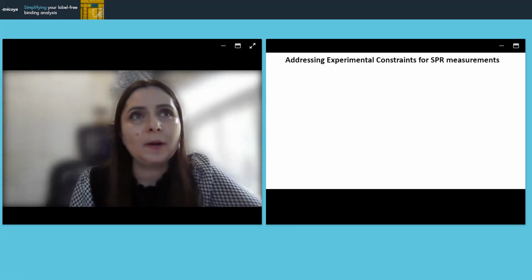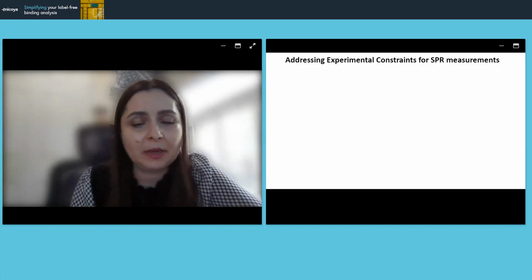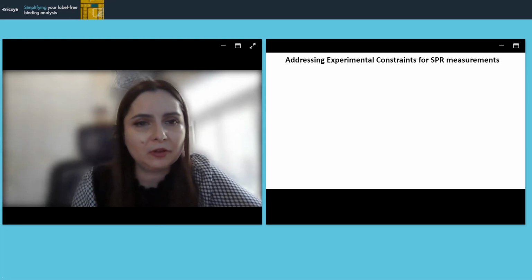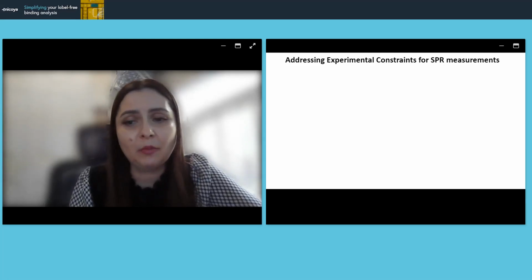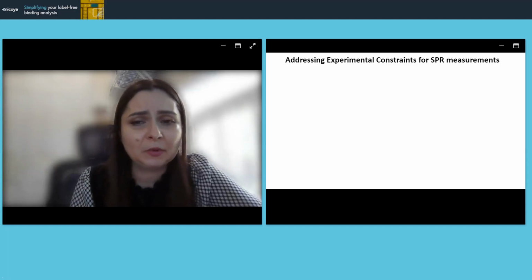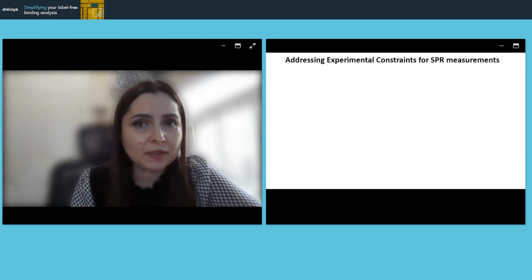And so all this testing on neurons is very time-consuming and expensive. As we continue our efforts to optimize the affinity even further, we're moving into protein mutagenesis and exploration of variability between the HTPs. We need a quicker way to test the affinities before we go into the cell cultures. And so we turned to SPR measurements.